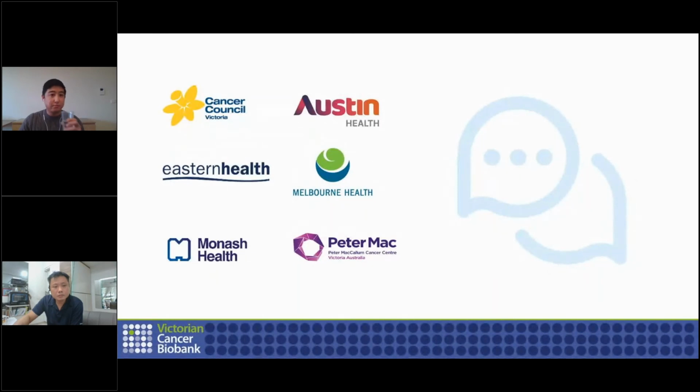So Chris, to add to Duncan's answer on the previous question that you asked about the user manual, as far as OpenSpecimen's user manual is concerned, you can go to help.openspecimen.org. I'll put it on the chat too. That is where all our latest user manual pages are, and you'll find extensive documentation on the reporting module there.